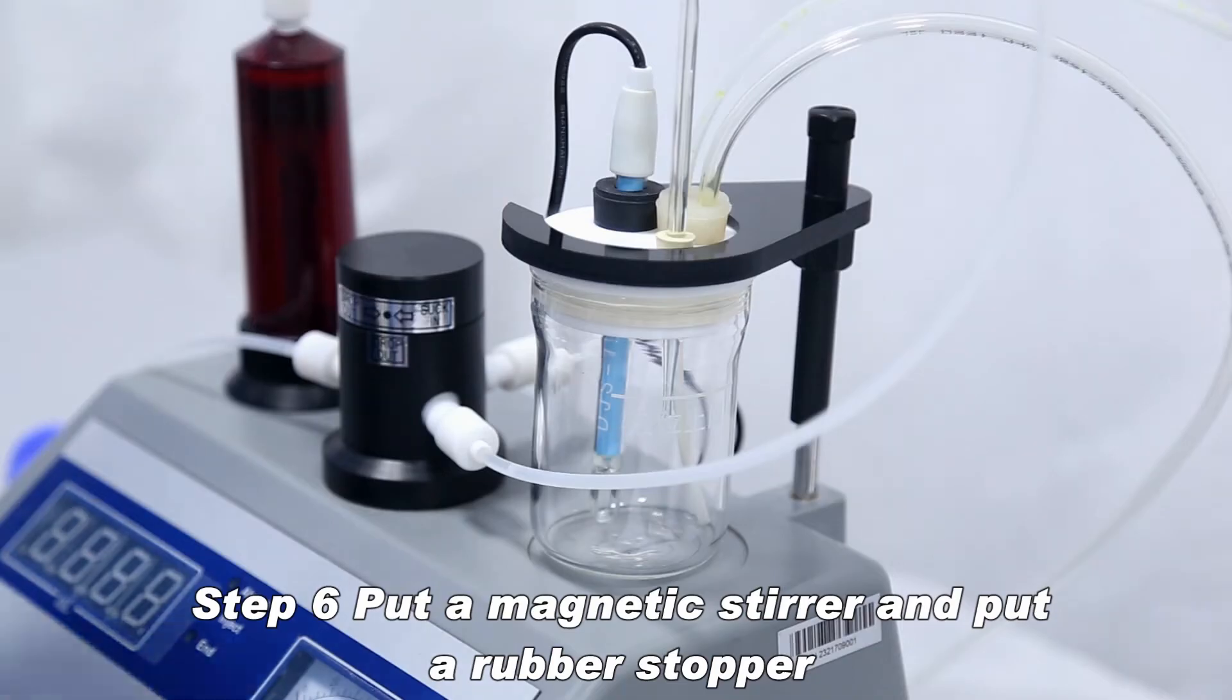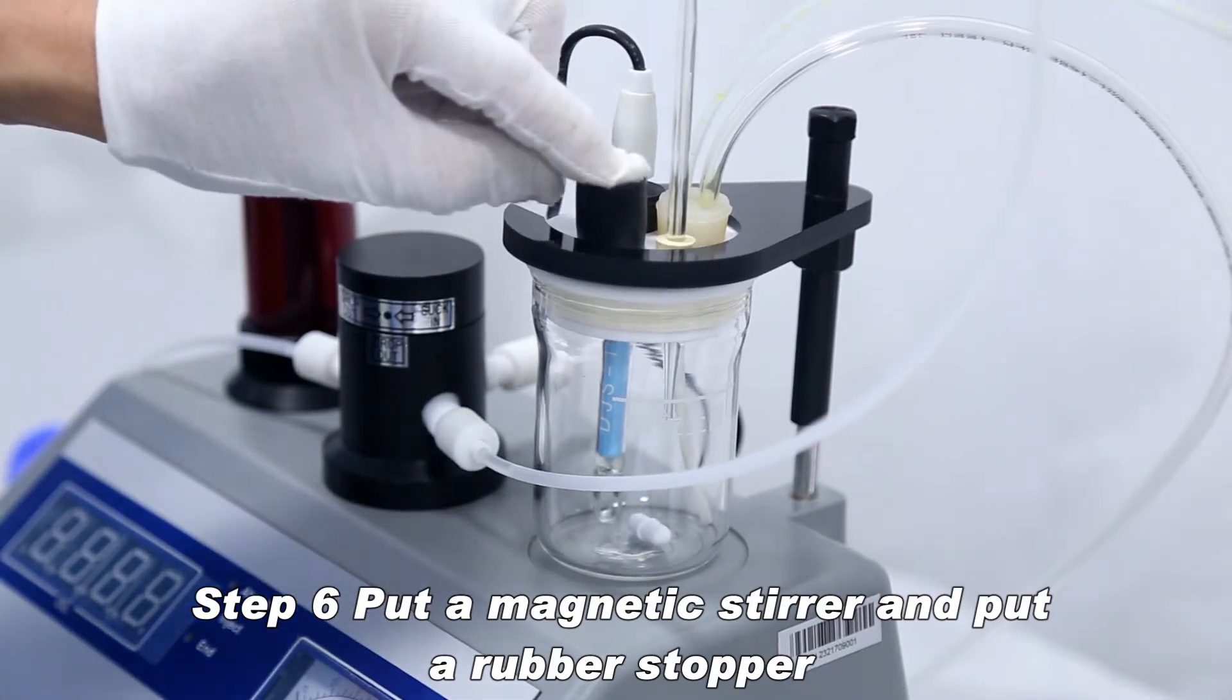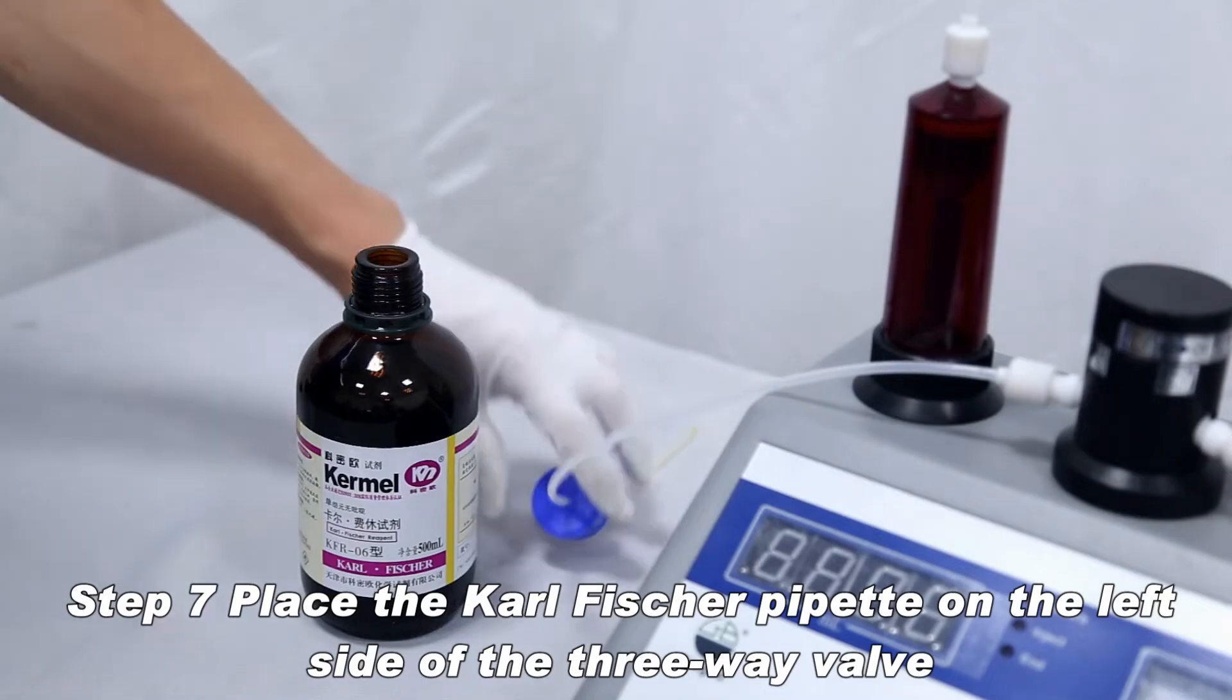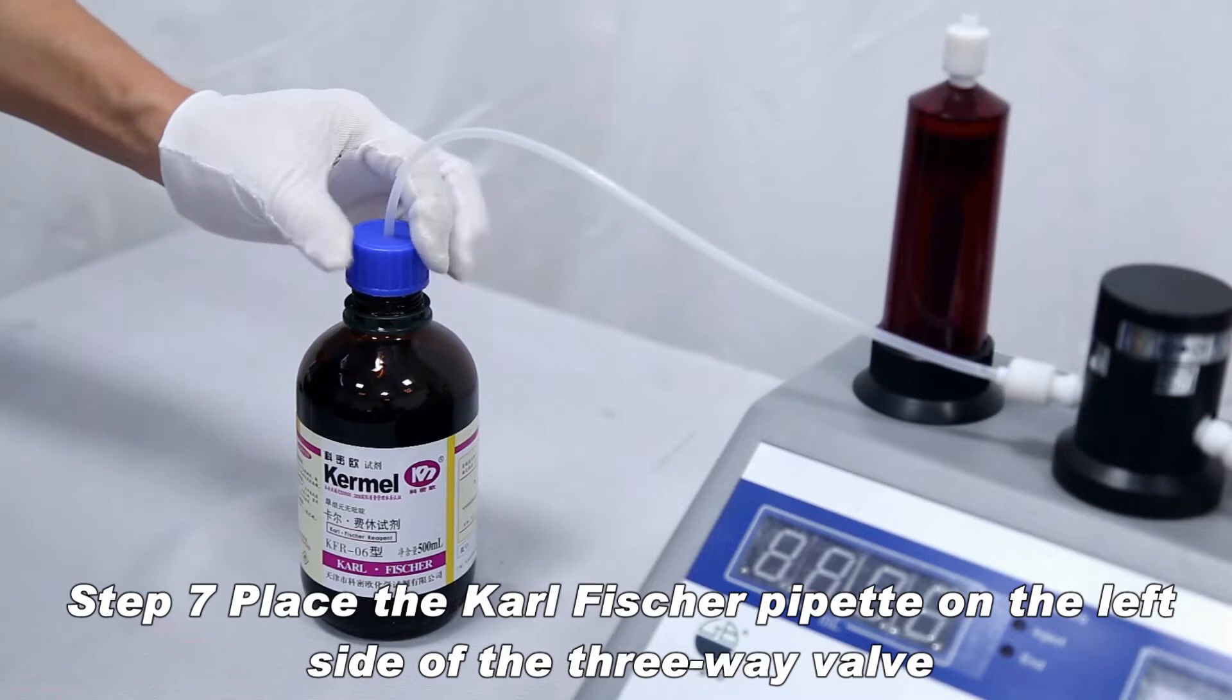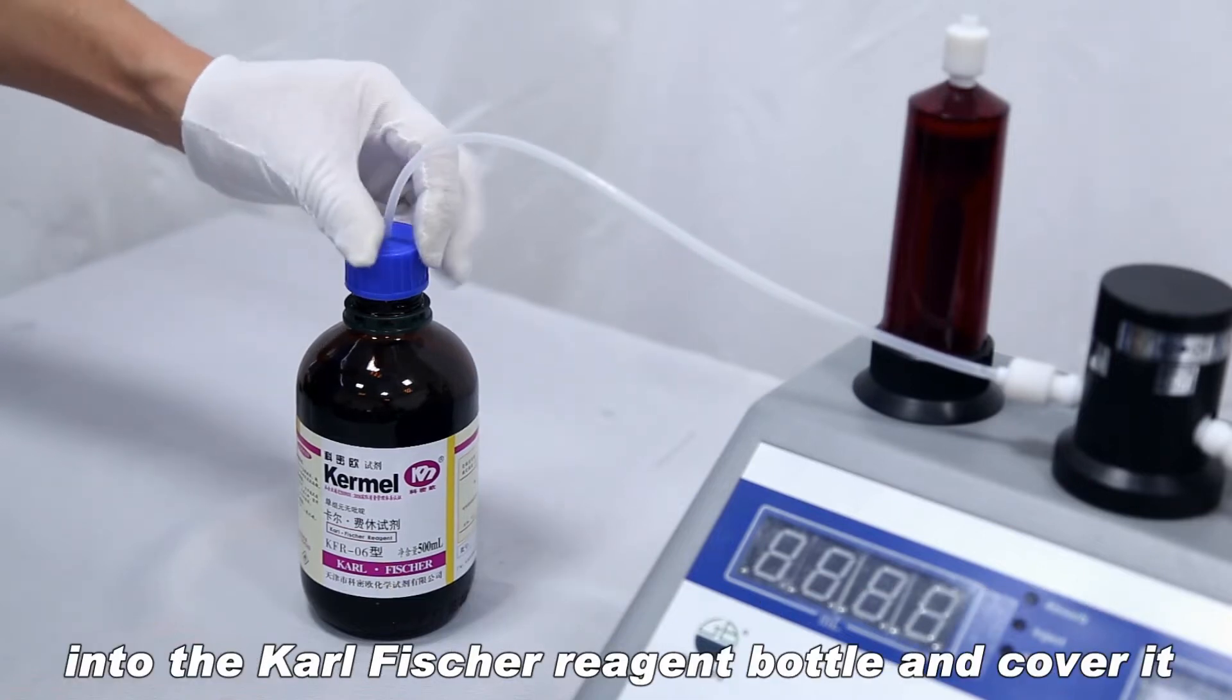Put a magnetic stirrer and put a rubber stopper. Place the Karl Fischer pipette on the left side of the three-way valve into the Karl Fischer reagent bottle and cover it.